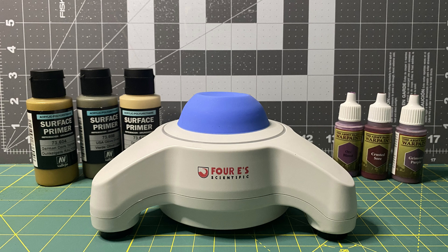The 4E shaker also has no issues mixing the larger paint bottles, such as the Vallejo color primers pictured here on the left.